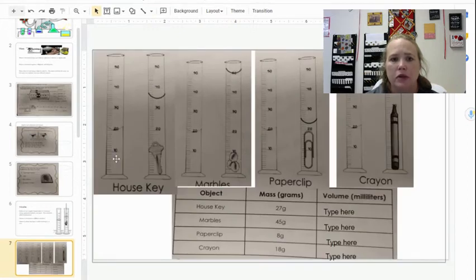Several students had trouble with this because they did not read the complete instructions on how to figure this out. So what you do is you take the measurement. If you have not watched the YouTube video, that was a lab tools review video that I just put together, several YouTube videos of people using different lab tools, go back and rewatch that, because this shows a bolt being measured this way and that will help you out a lot. Okay, so you're going to take the measurement of the liquid in the graduated cylinder.